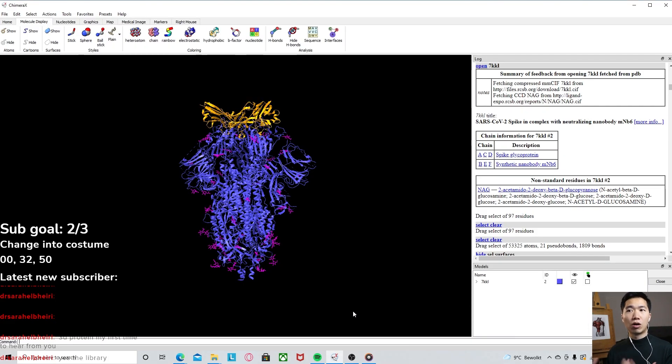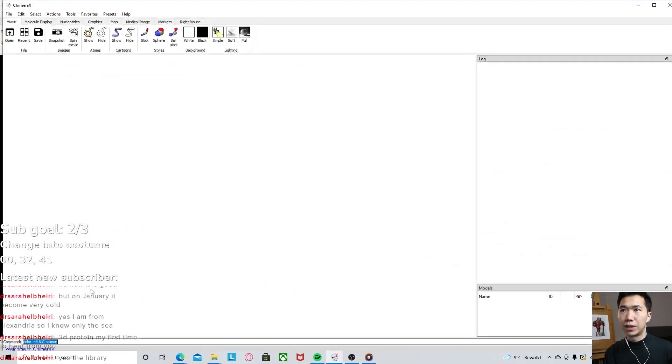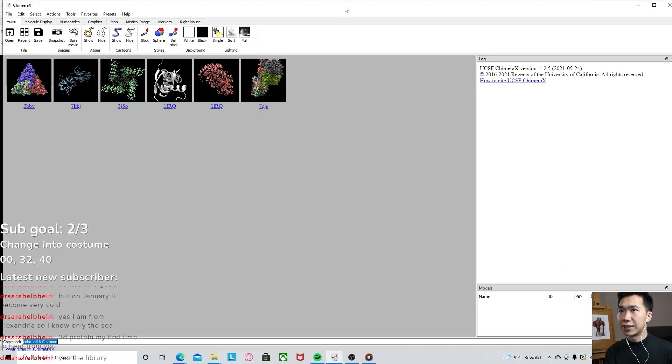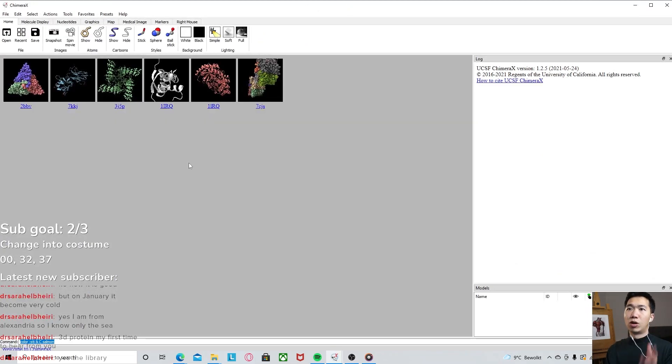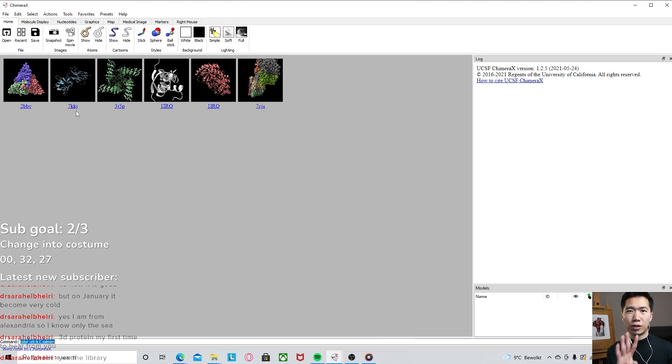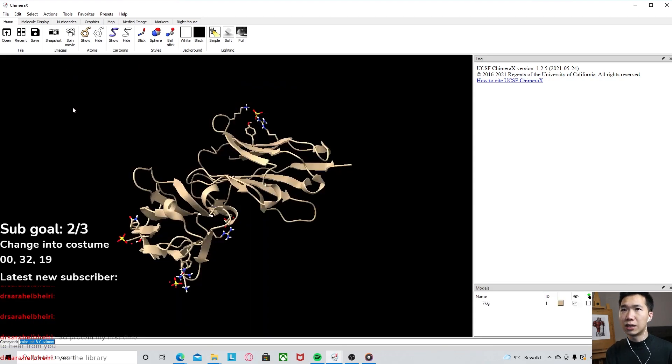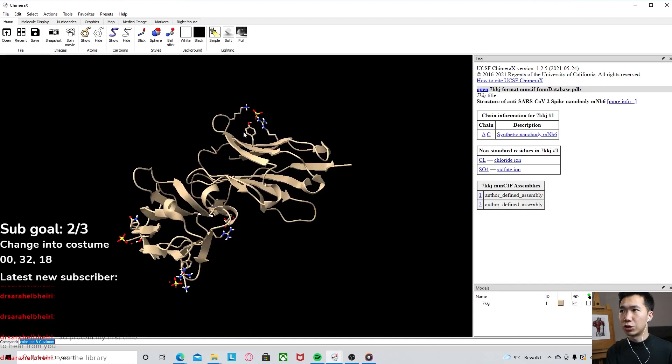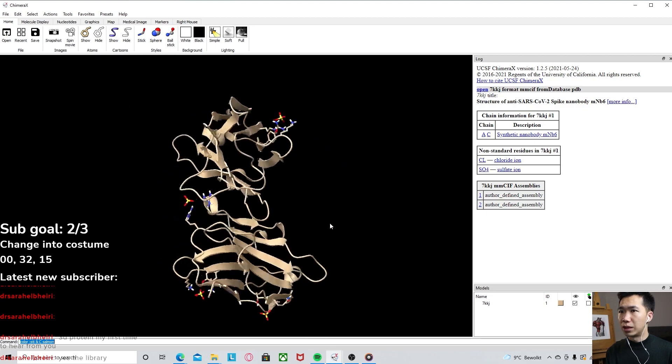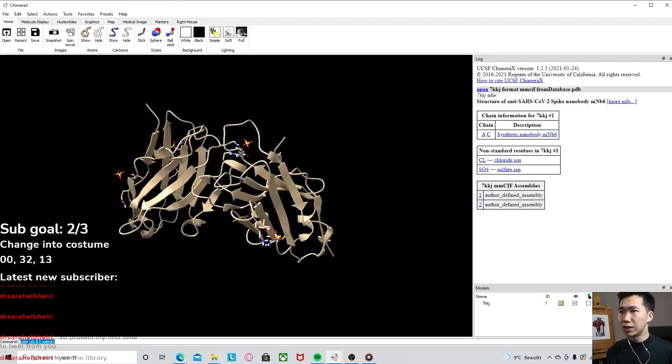How do we call out the protein that we want? We will start from the database. When you open ChimeraX, it will have a welcome interface like this to welcome you, and you see that there are some example proteins. They have this four-digit coding. This one is coded as 7kkj. If we click into it, then it will open that protein structure for us.